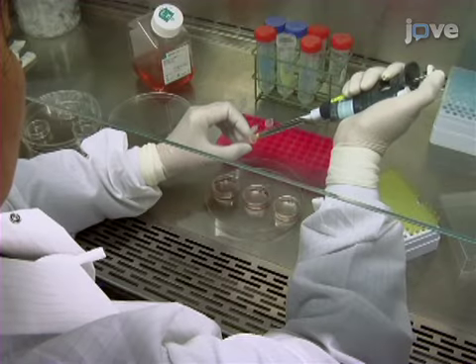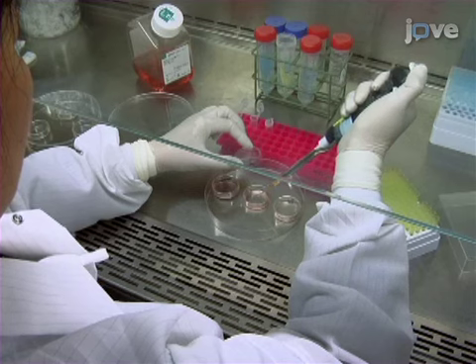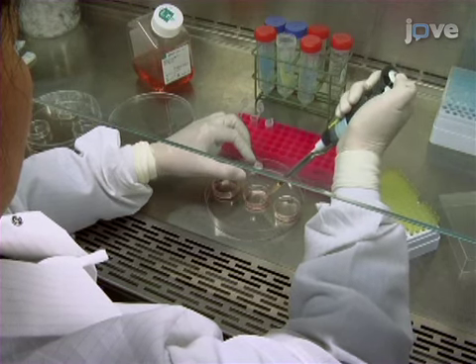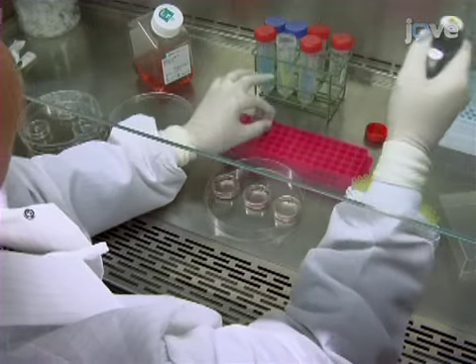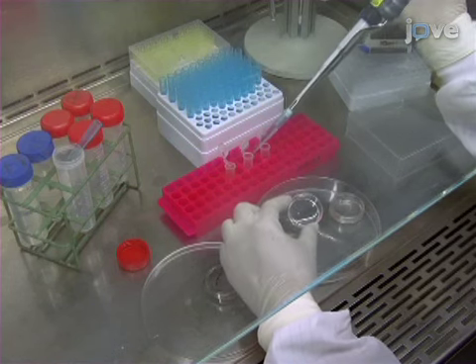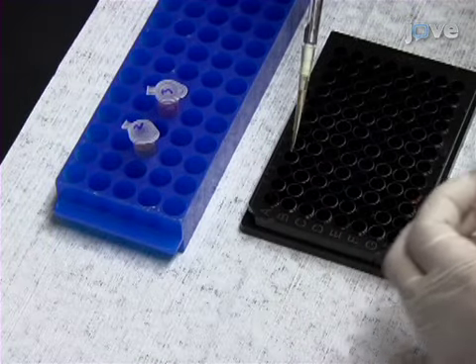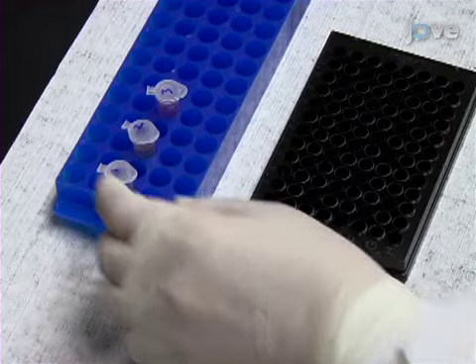To assess antibody inhibition, co-transfect Jurkat cells with Nef-GFP and either anti-alpha tubulin or anti-mortalin antibody using the Chariot protein delivery reagent kit as described in the accompanying document. Collect the cell-free conditioned medium from the harvested cells. Transfer 100 microliters to individual wells of a 96-well black microtiter plate.